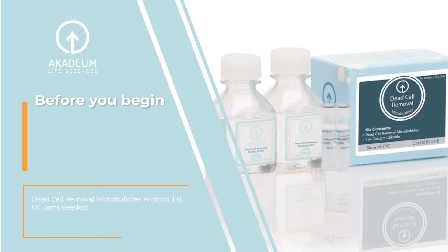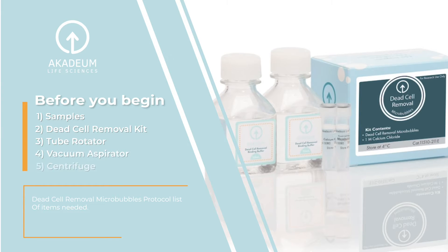Before we get started, let's make sure we have everything we need. Of course, you're going to need your samples, the dead cell removal kit, a rotator, aspiration, and a centrifuge.